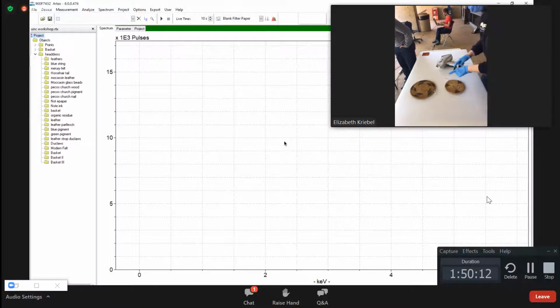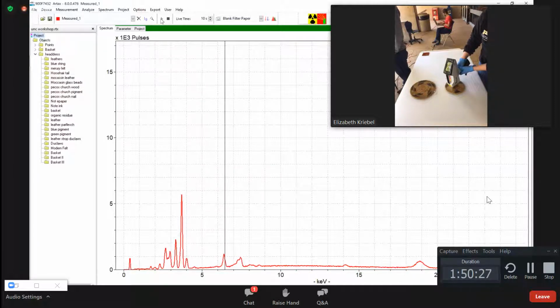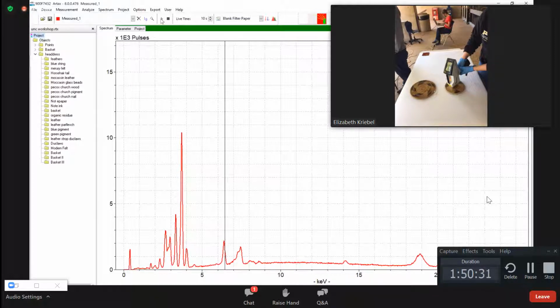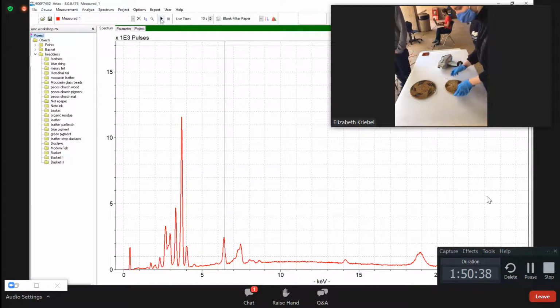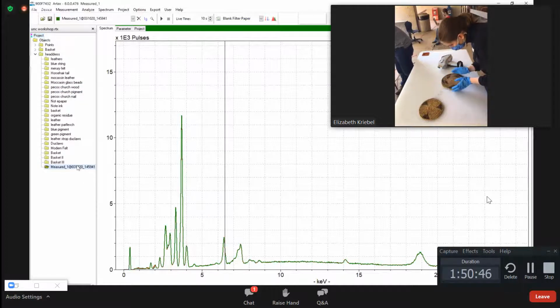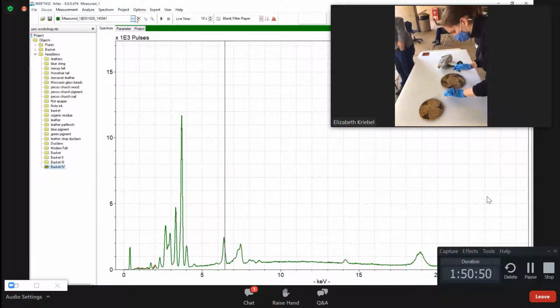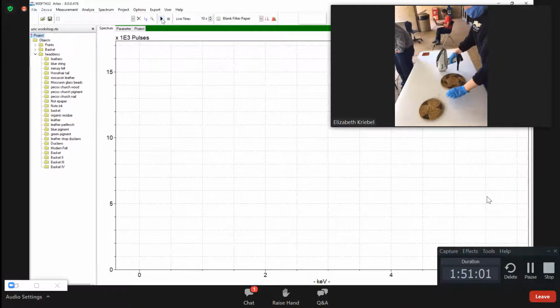All right. Are you ready? All right, so this one's 69.3.10. Ready? All right. Starting. All right. Calcium, potassium, a little bit of sulfur, but no toxins to be concerned about, no salt wash. All right. And then this one has the same first two numbers, but the last number is 9 instead of 10. Sorry, so it's 69.9.9.